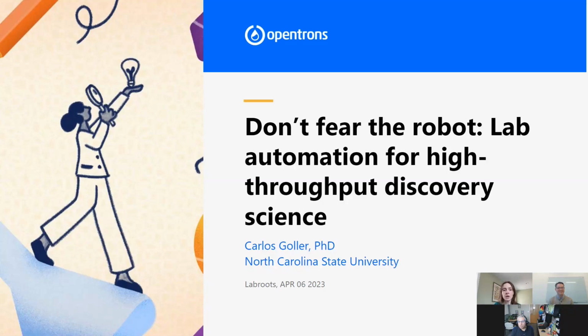So the most introductory way is to use our protocol designer GUI, which Carlos mentioned using, and which I showed a little bit of a short demo in the talk. It's GUI based. It's very friendly to use, and it's a good way of beginning to play around with the robot.